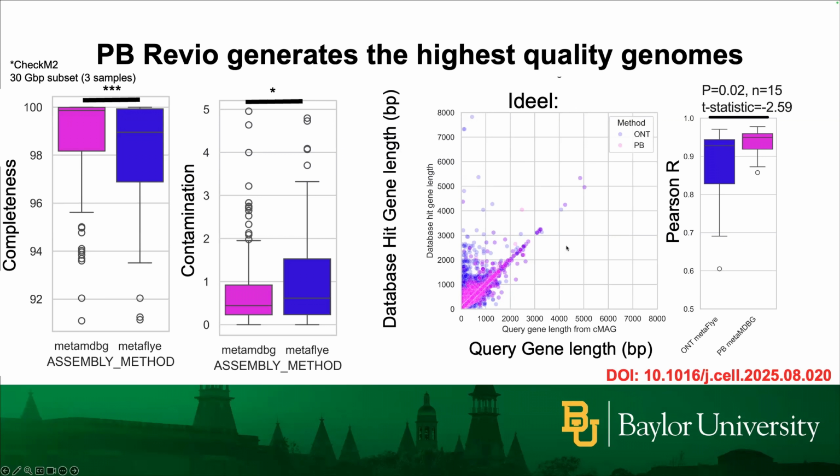And then we also used this IDEEL approach developed by Nick Watson, and the genomes themselves were also of higher quality. If an error is introduced into your genome, then when you go to annotate it, the genes themselves could be truncated artificially. So if your genes are shorter in your annotated genome as compared to what's in the database, then you would see a difference here. That's essentially what you see in this plot to the right, and again, that also was significant.